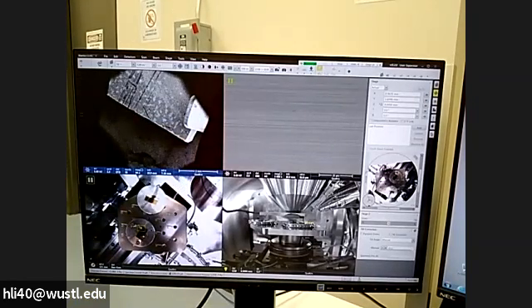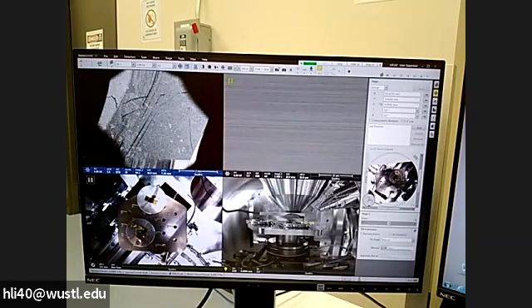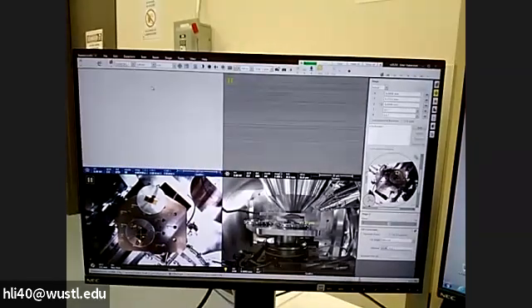Okay, we are pretty much close to the place. A little bit off. We are in the corner on this image, but this is a little bit off. So we try to find the place we like. Okay, any place. We just zoom in and bring it to focus again.